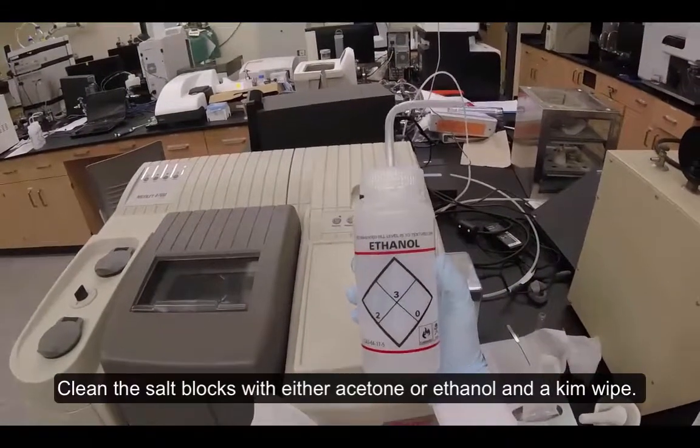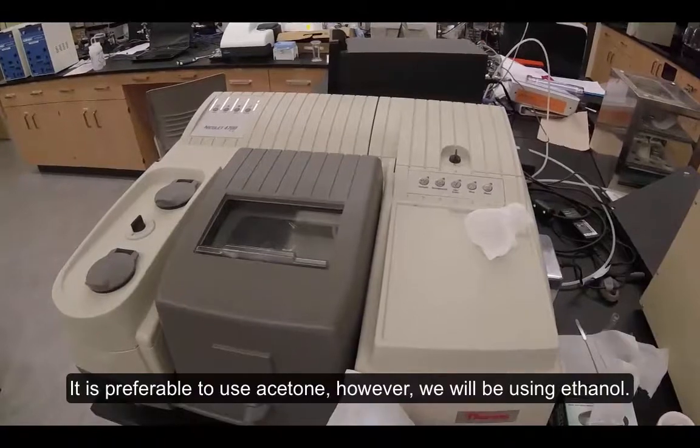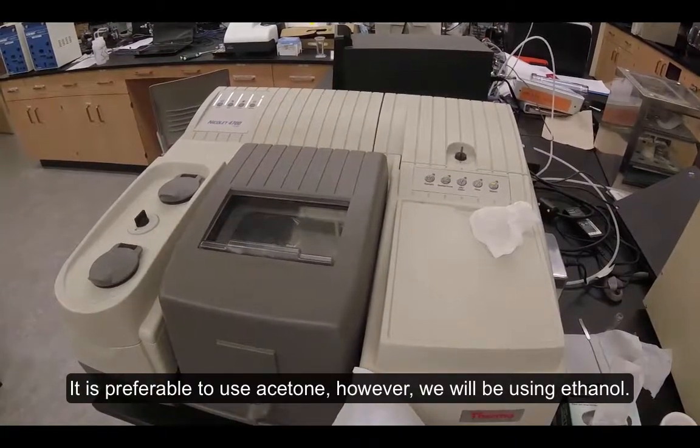Clean the salt blocks with either acetone or ethanol and a chem wipe. It is preferable to use acetone; however, we will be using ethanol.